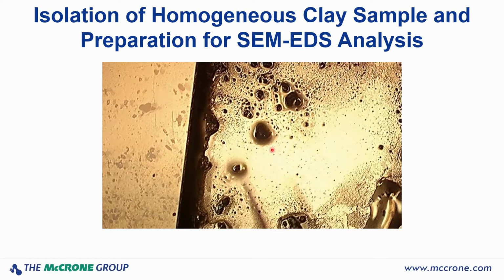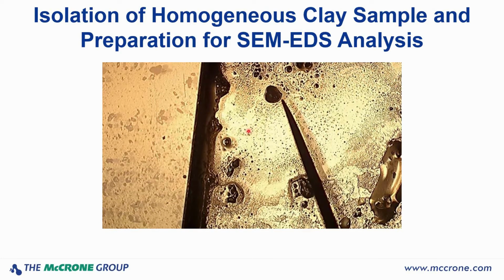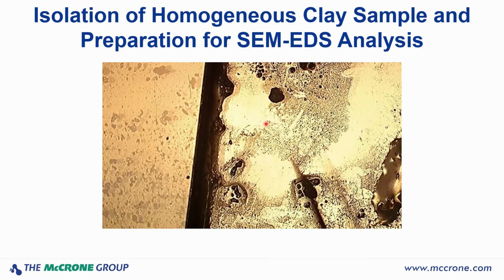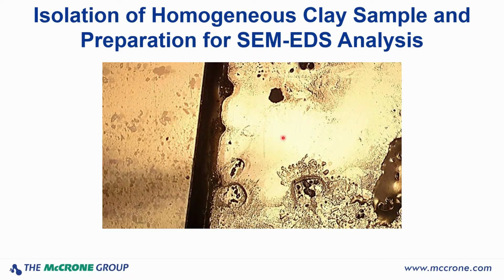Let it dry a little bit. I'm going to come in. This is my particle that I'm going to work with. So I'm going to pull some of that amyl acetate off to allow that particle to dry a little more quickly. And you'll see that amyl acetate is drying, so we don't see that clay residue.